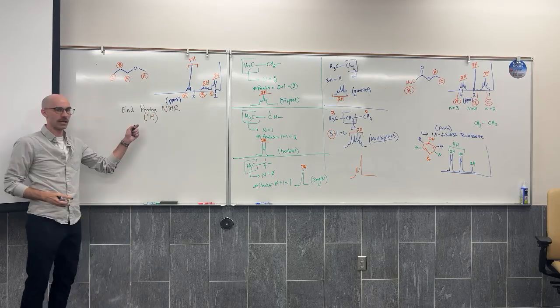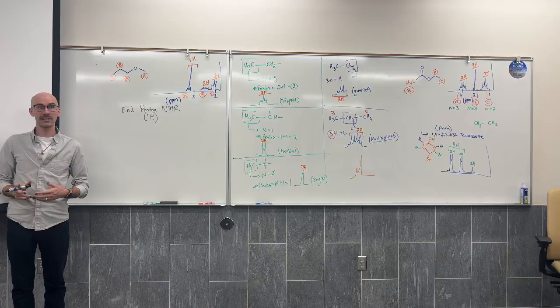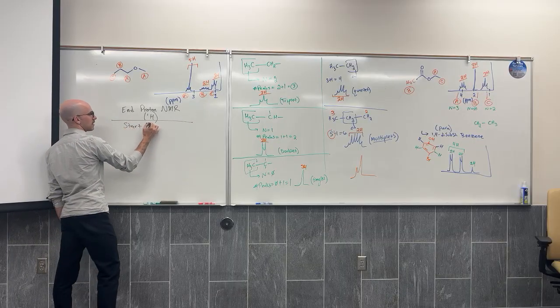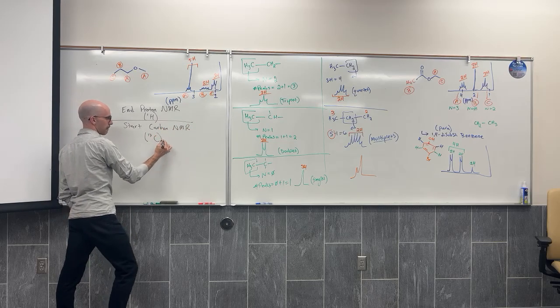Which, remember, proton is the hydrogen nucleus. So proton NMR is analyzing H1. Okay, let's start carbon NMR, which is referred to as C13.